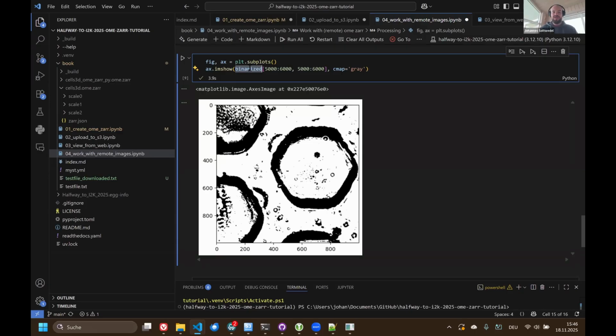And this execution can happen locally on your device. It can happen on an HPC cluster. It really doesn't matter. So you can use the same code on all different kinds of platforms while having the data in one place, which is your cloud storage of your image data. And I think this is a really neat way to keep the data in one place and not have to wrangle or re-engineer all your workflows for more complex or bigger data sets.